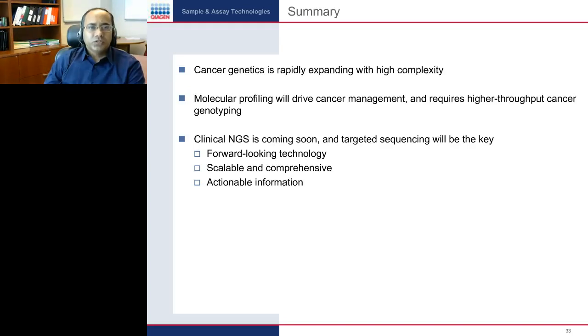One of the questions is whether QIAGEN has developed PCR arrays for Drosophila. The answer to that is no. Right now we have these targeted next-gen sequencing panels only for humans.